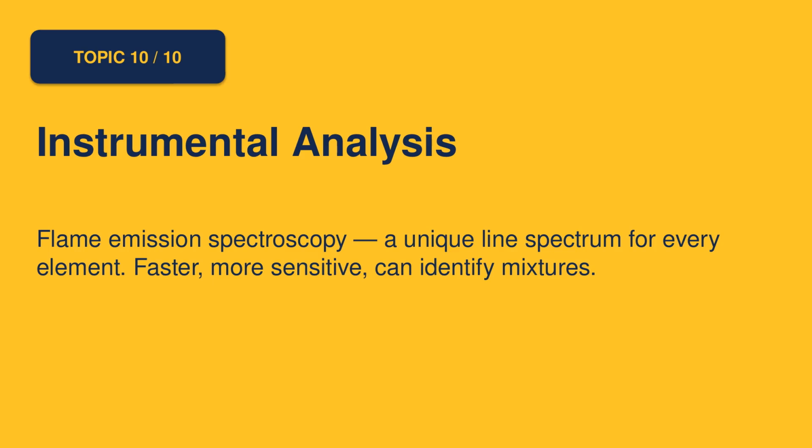Flame emission spectroscopy, a unique line spectrum for every element. It's faster, more sensitive, and can identify mixtures.